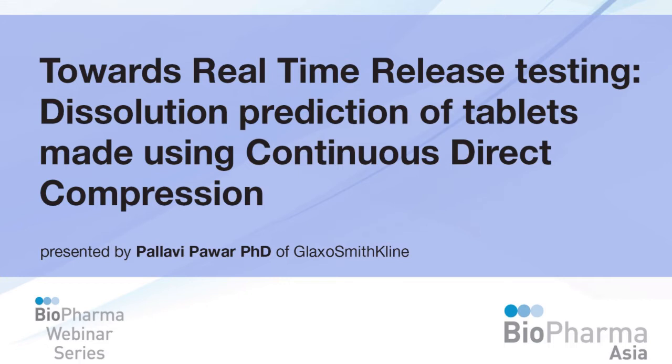So as Sri said, I am going to talk about the concept of real-time release testing, especially applied to an important tablet critical quality attribute, that is tablet dissolution. And to further explain this, I am going to jump into a case study that we did at Rutgers University during my grad school, where we applied this concept of real-time release testing for dissolution prediction of tablets made on the continuous manufacturing line.